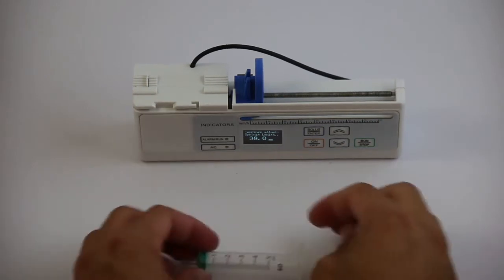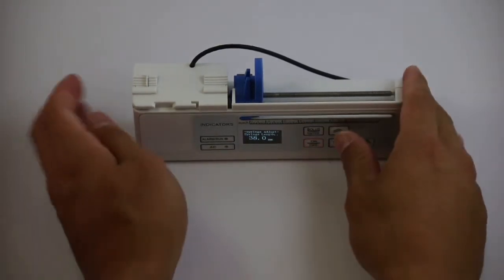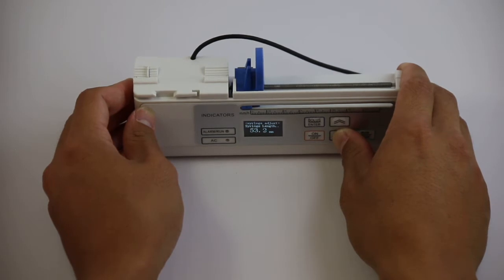Click the up or down arrows to select the right effective length. Press and hold the up or down arrow to increase or decrease the value at a faster rate.